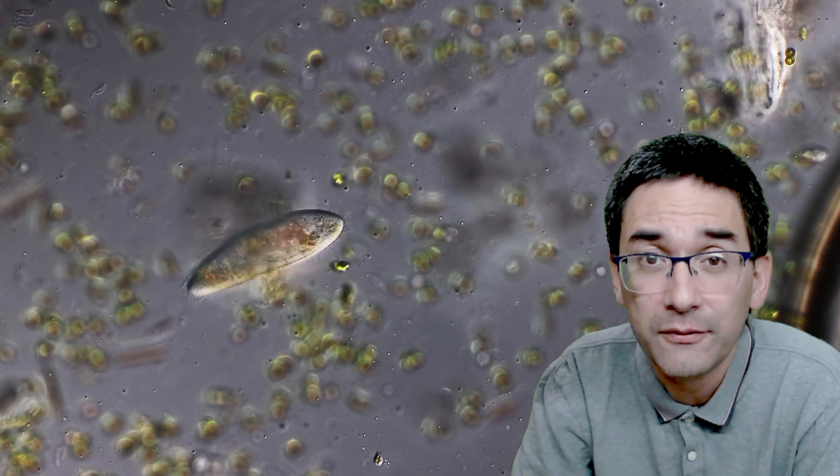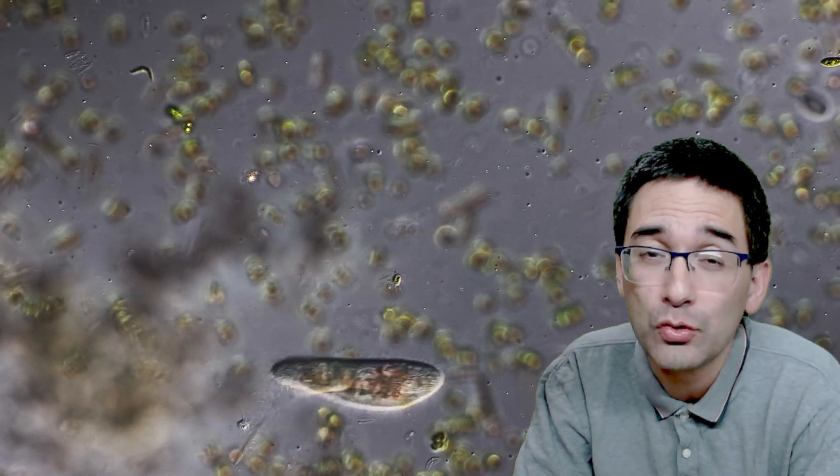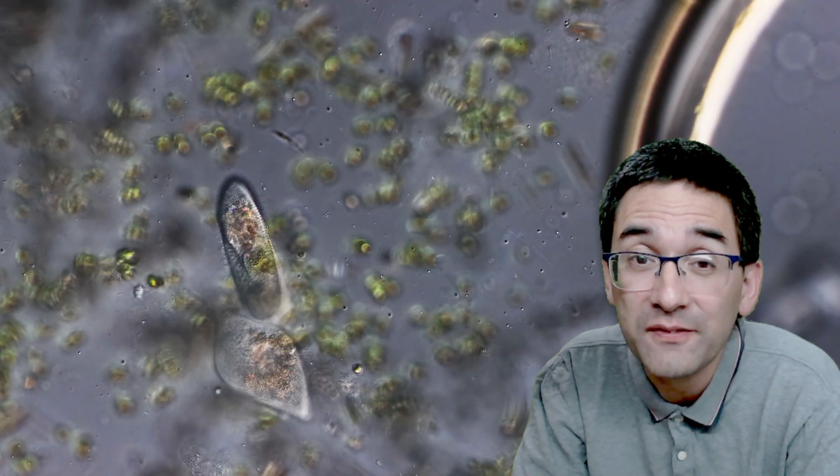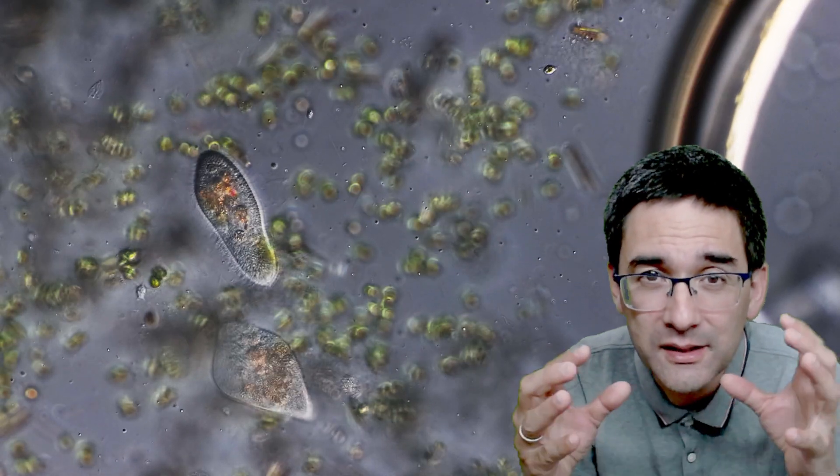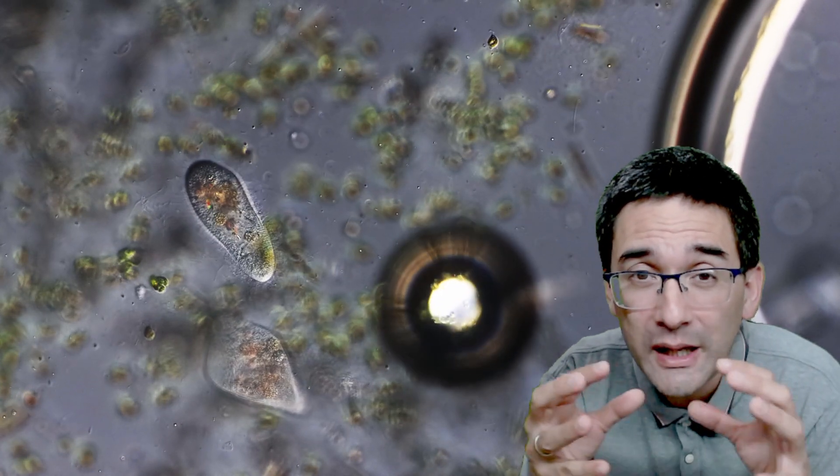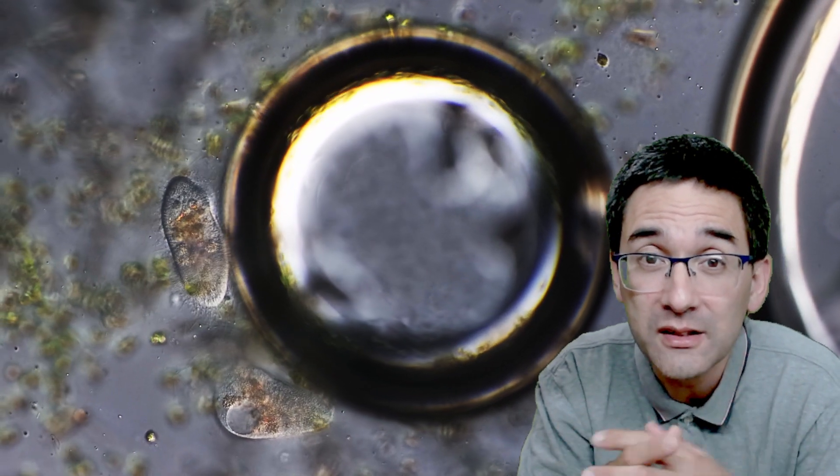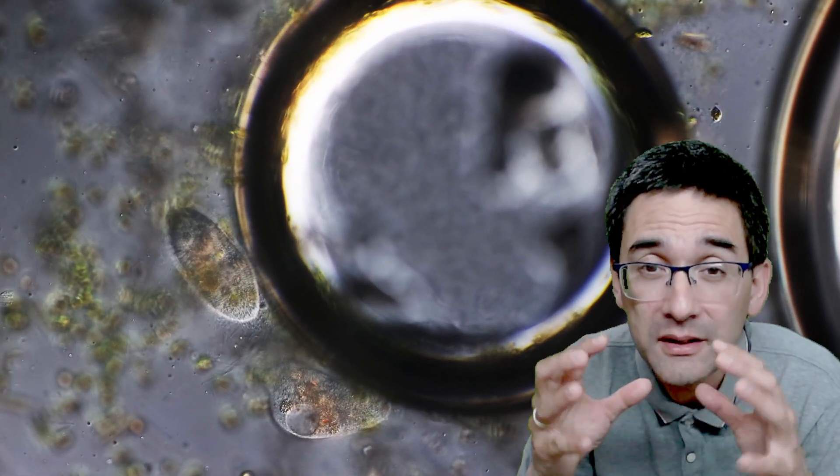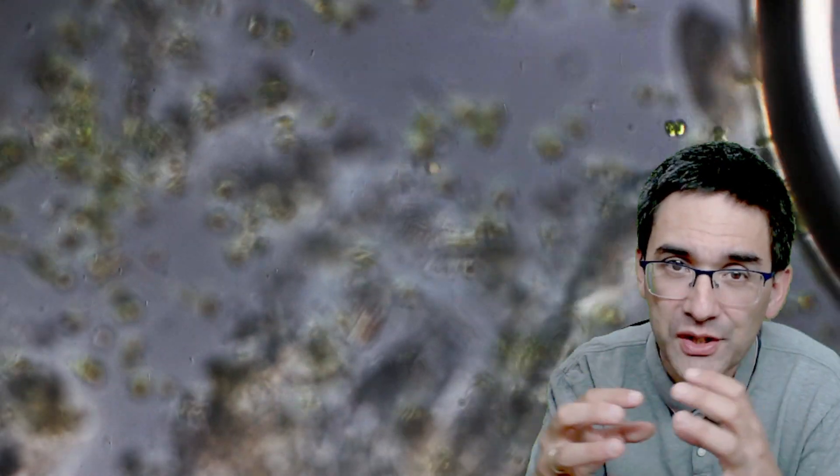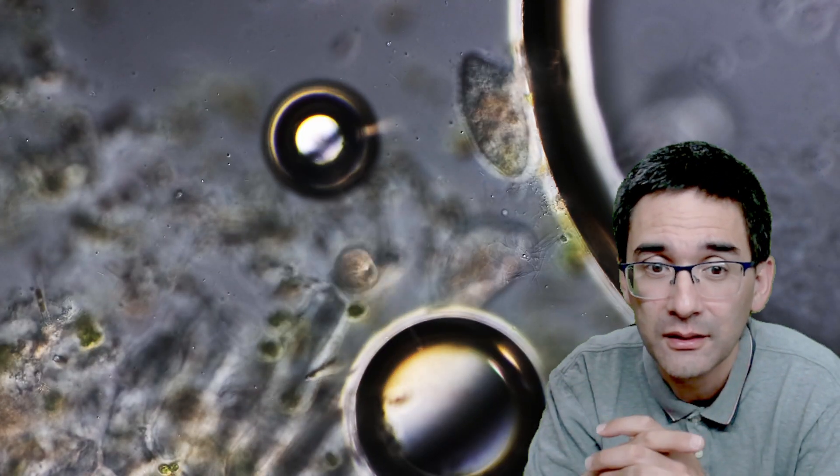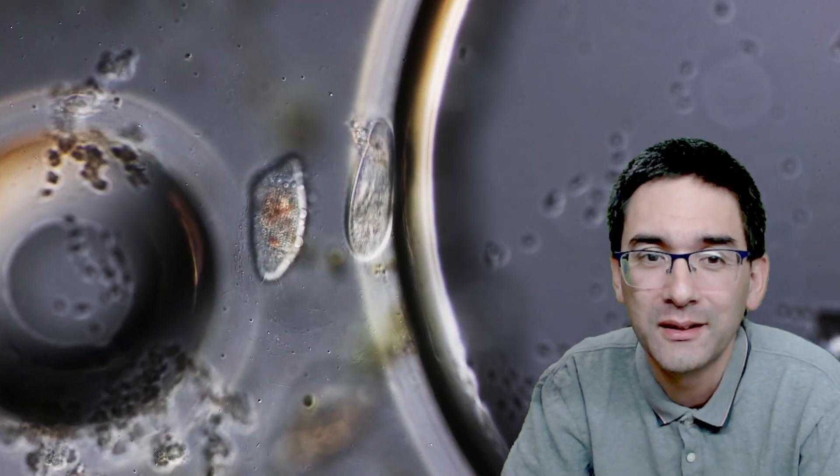I was also able to find another one here. This is again a paramecium, and it starts to spin in this strange manner when the hydrogen peroxide disinfectant reaches it. It did not immediately break apart but changed behavior a little bit as the hydrogen peroxide slowly started to break down organic substances in the cell. Again, an oxygen bubble forming relatively spontaneously, maybe because some bacteria present in the sample also contained the enzyme catalase that breaks it down. You see oxygen bubbles fusing together—here again two more oxygen bubbles forming. In between is squeezed this paramecium.